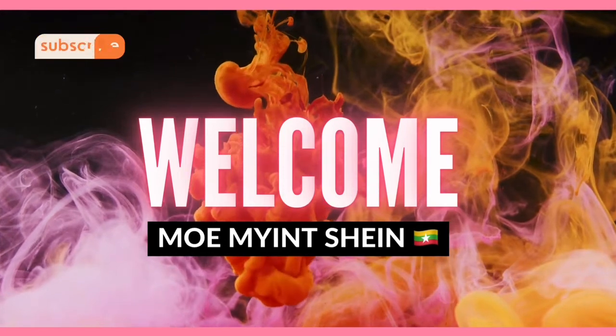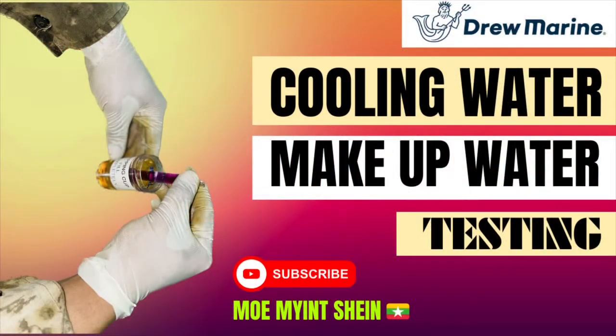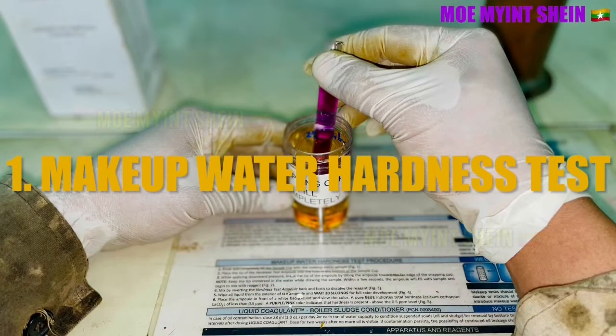Hello, welcome again. Today we will carry out makeup water test and cooling water test for engines. As first, you can see the makeup water hardness test.